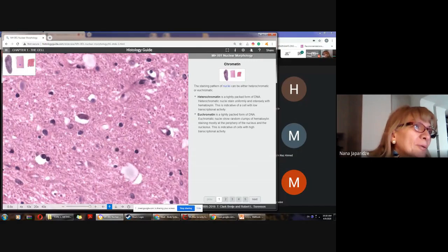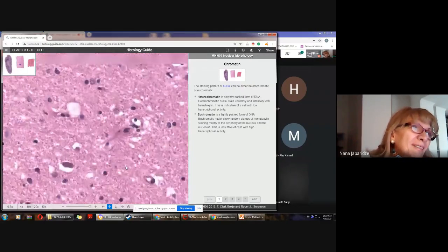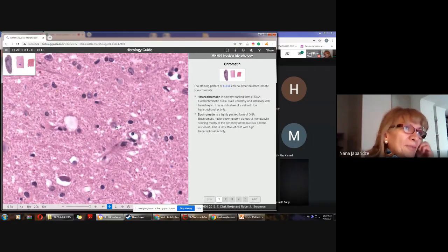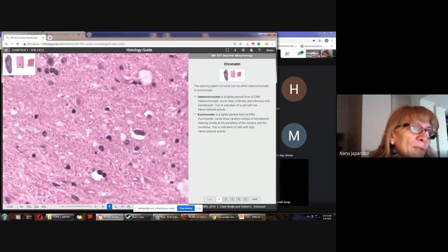Maybe because I work at the brain ultrastructure and nano architecture lab. So this is the title of the lab where I'm working as a researcher, and I think this is an amazing organ of the human body. So look, you see here neurons.